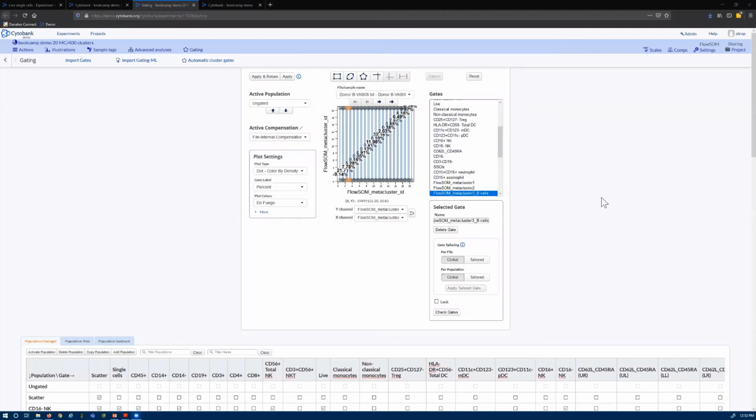You might need to specify a weight for those clustering results produced by the other algorithms. You can incorporate them, and run FlowSOM in a semi-unsupervised approach, but usually we recommend you just run FlowSOM using the purely unsupervised approach to do the analysis. Okay, thank you, Jihao, very much.